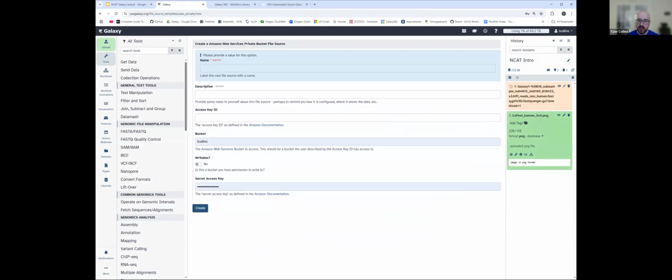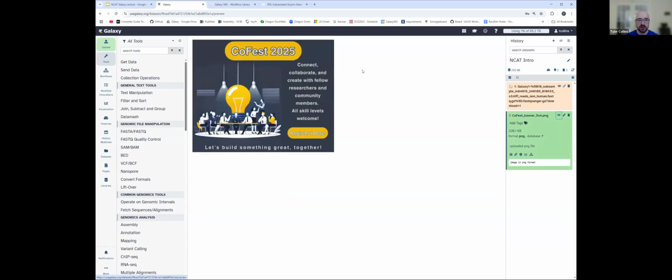Here you'll have a couple main things. You'll have the size of the file, what format it's in, its name, and you can click this little eye to get a quick look inside the file to see what's happening. So in this case, you can see there's our PNG. We can see it here in the middle. This is a graphic for the upcoming GBCC conference for the group hackathon that people will be doing.